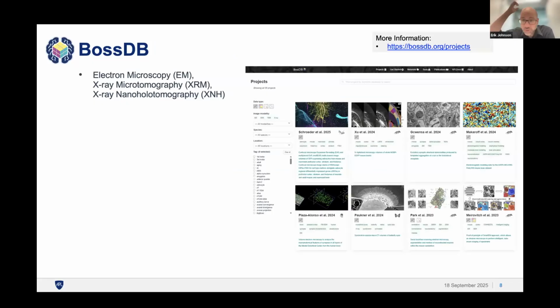So a few things. You can go right now if you're interested to bossdb.org and follow along as we go through this talk here. But a few of the things that I'll highlight here. We have projects that incorporate a wide range of different volume electron microscopy techniques, as well as X-ray microtomography and nanoholotomography approaches. If you go to our projects page, you can get a sense of the wide range of things that are supported. Each page has a lot of detail on the individual efforts, data sets, and analysis to give you a quick overview of all the different things that you can find within the system.